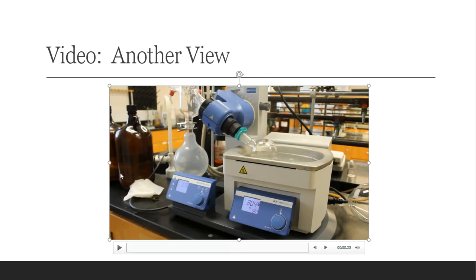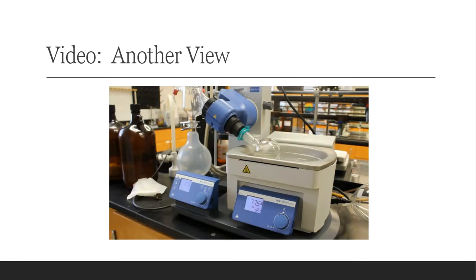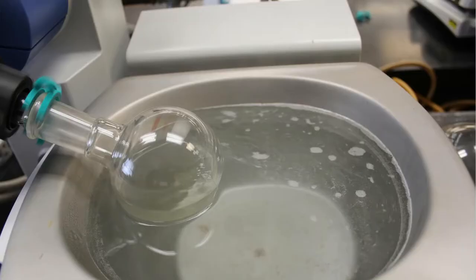So once more, I just want to say that this water boils at 100. If I dial this up hotter than 100, it will never reach that temperature. Once again, though, that's very good news. My petroleum ether has a lower boiling point. That's why we can use water in this case, and that's why my ether is going up and over into the receiving flask. I don't really like to use oil, because if you can imagine this vat filled with mineral oil or something similar to that, I mean, this is just crazy. It makes a mess. It's very hard to clean. I just hate it.